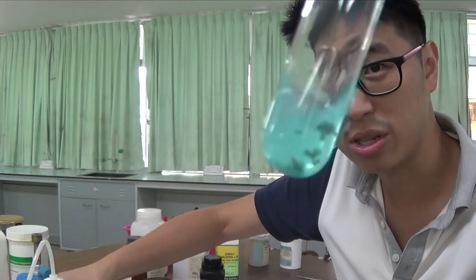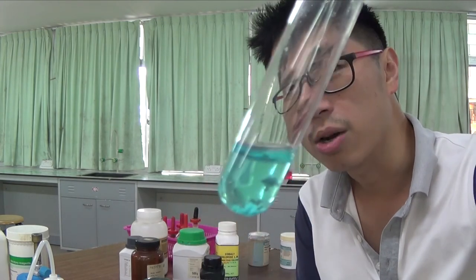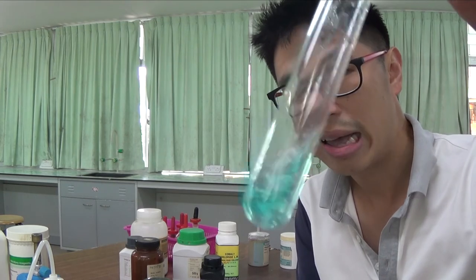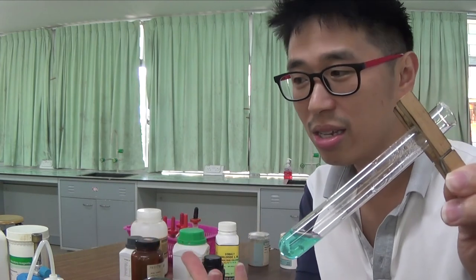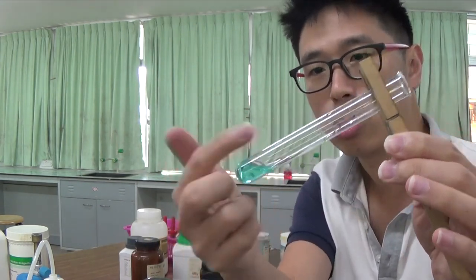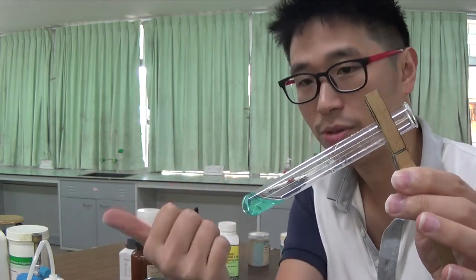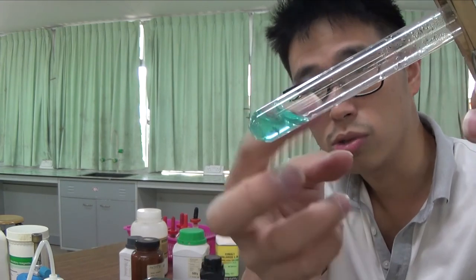What do you notice? All right, what do you notice? So they can ask you this in a qualitative analysis experiment, not just in O level, but most likely in A level, where they give you a blue colored solid, they ask you to heat it, and then you see a colorless liquid form on the upper part of the tube, the blue solid goes white. You heat strongly until it goes white, that's your observation, and then you add water to it after it cools down, and you get a blue solution again.